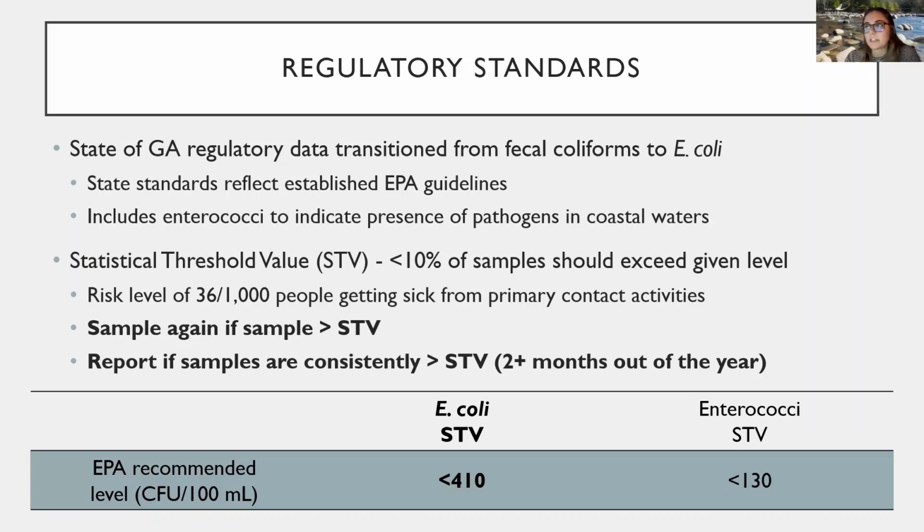It shows you that if I'm only finding an average of 3 colony forming units on my plates, look how close I already am to this regulatory level, right? It doesn't take much for this E. coli and these pathogens to be of a level of concern. So that's why it's really important for us to go out and check these levels.